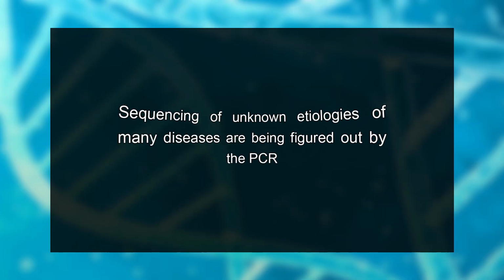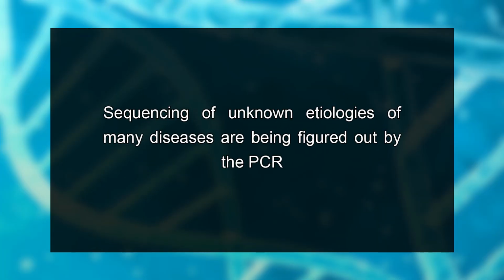PCR is a very powerful and practical research tool. The sequencing of unknown etiologies of many diseases are being figured out by the PCR. The technique can help identify the sequence of previously unknown viruses related to those already known and thus give us a better understanding of the disease itself. If the procedure can be further simplified and sensitive non-radiometric detection systems can be developed, the PCR will assume a prominent place in the clinical laboratory for years to come.